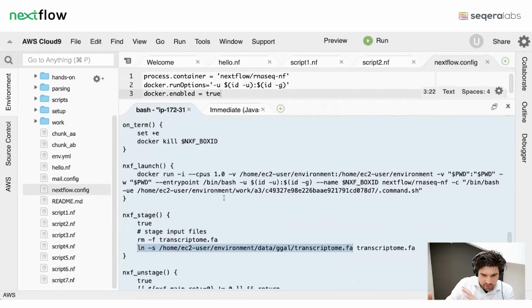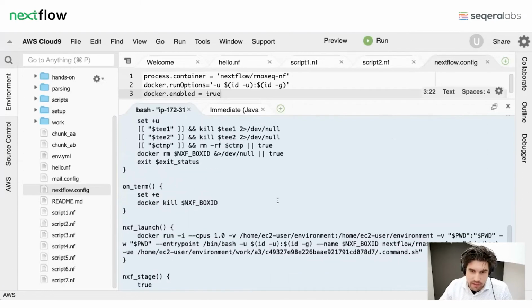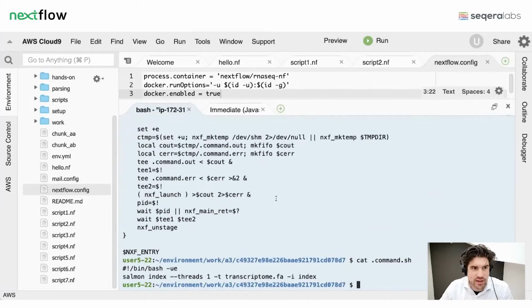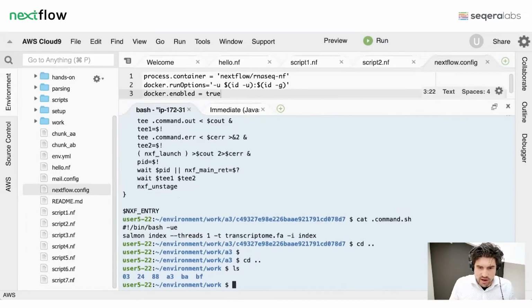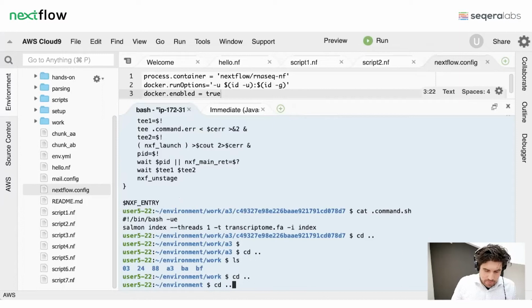And when you run in the cloud, for example, it's taking care of uploading it to the right place to run that as well. In terms of what if we wanted to change that though? What if we wanted to change, instead of here you can see it's threads 1, what if we wanted to use 2? How do we do that? A whole bunch of different ways we can change that. We can try, but let's go back to our working location where we're launching this.